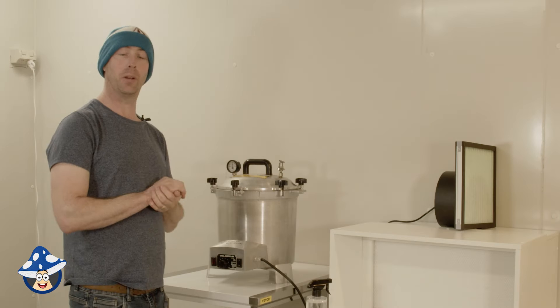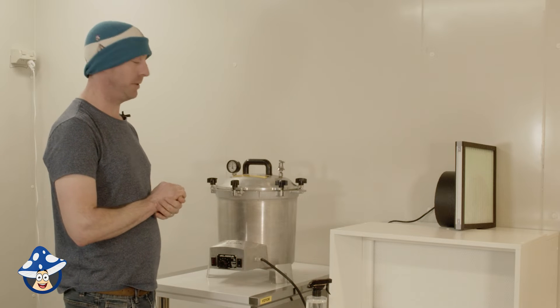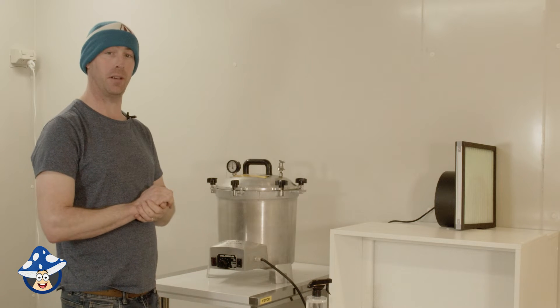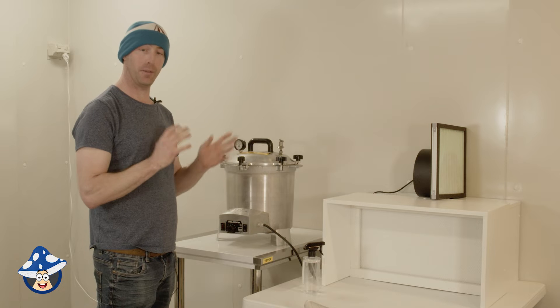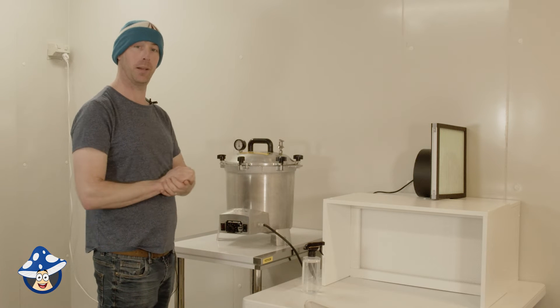So our agar has been cooking at around 17 PSI for 45 minutes. We've just turned it off. We're going to turn our flow hood on so it has time to run for a good half an hour, 45 minutes while the pressure cooker cools down on its own and that will help filter all the air in the room of any spores flying around and make it a bit cleaner while we unload and put it into our sterile airflow.